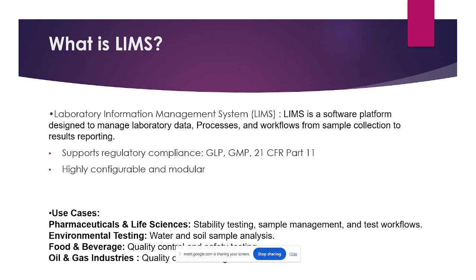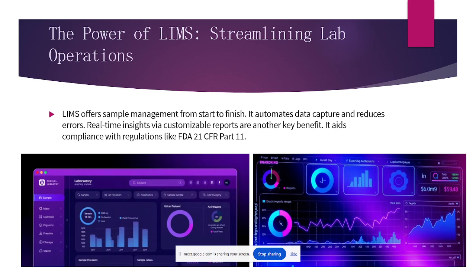Now the use cases, where this LIMS application is useful. Majorly it is useful in pharmaceutical and life sciences for regular testing, stability testing, managing inventories, and environmental monitoring. For this purpose we use it in pharmaceutical. Food and beverage industries also use LIMS applications, and oil and gas industries also. I'm talking about LIMS in general, not any specific LIMS.